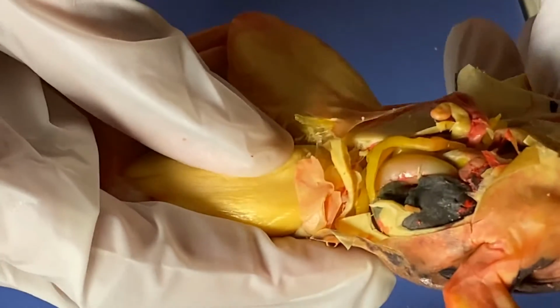So on the inside, as I cut it through, you can see that I'm exposing a lot of internal organs here.